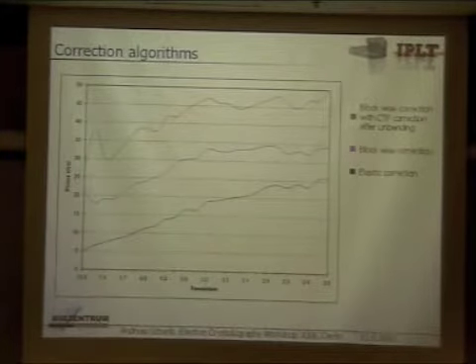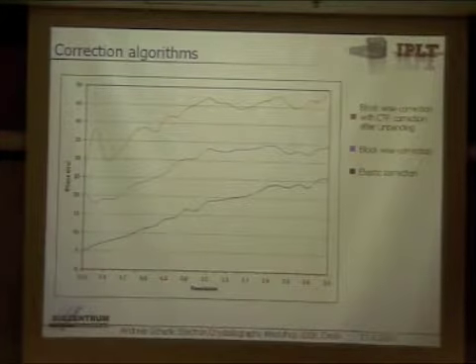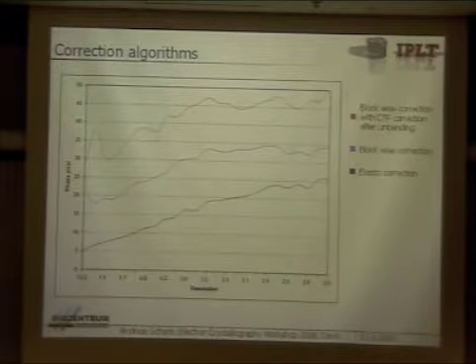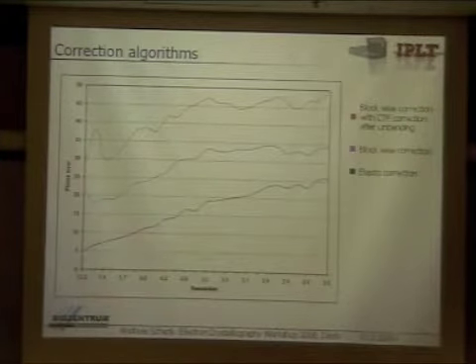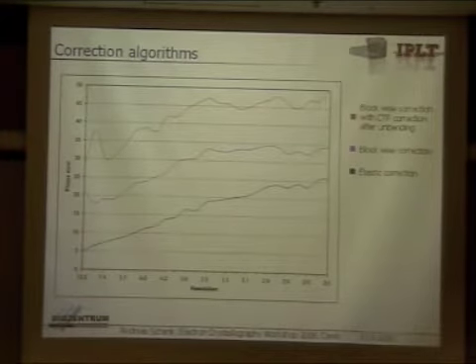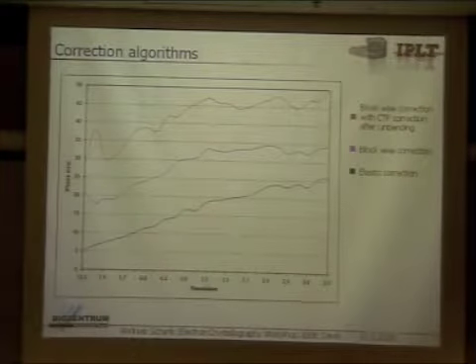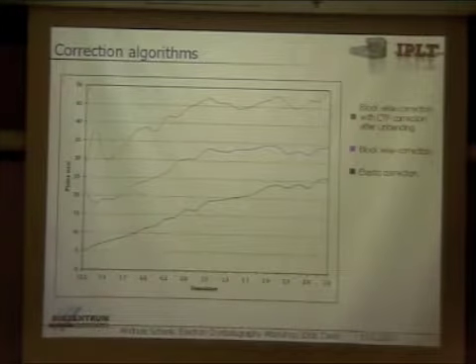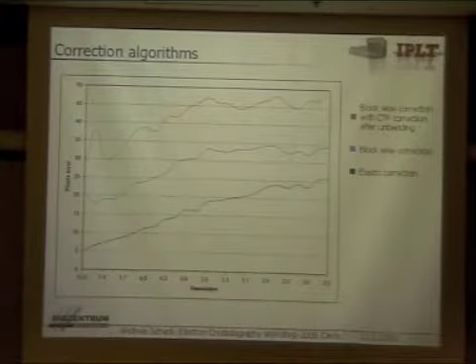Andreas, would it be difficult for you to show the diffraction pattern of this bent crystal so that we have a feel for it? I haven't calculated that. Usually we look first at the diffraction pattern before we do all this unbending, and it would be quite instructive. Yeah, I could have done that, but unfortunately I don't have it.